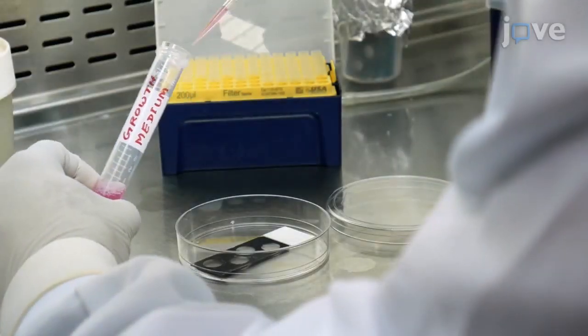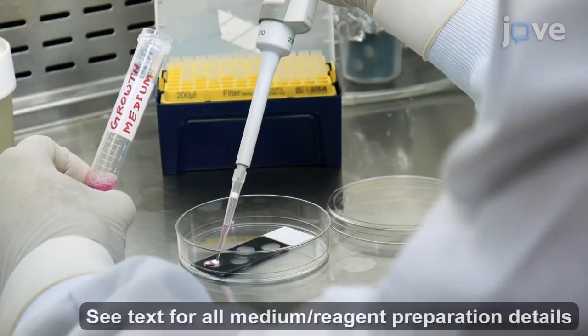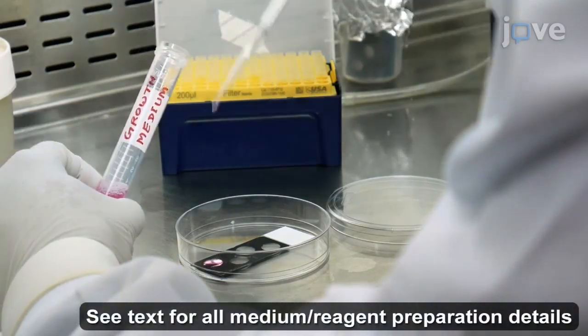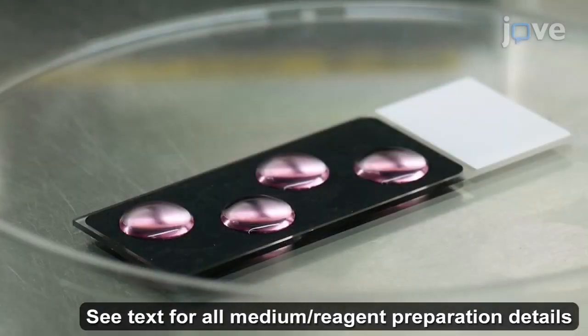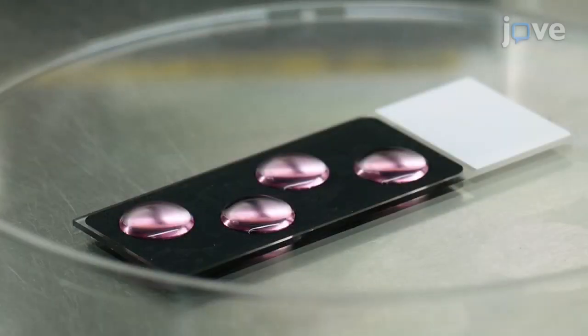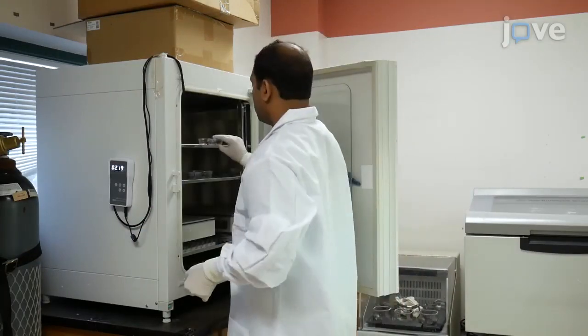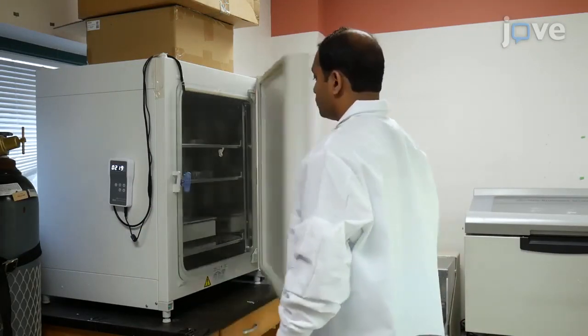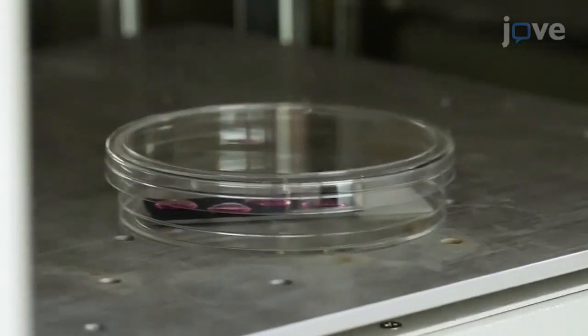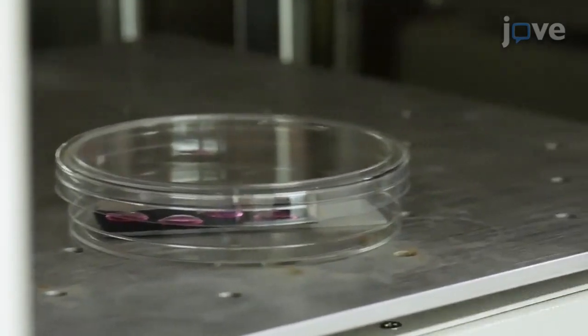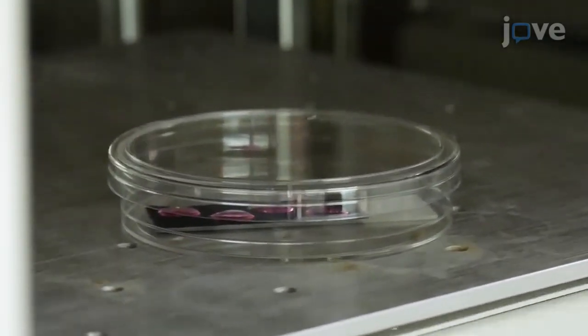20 to 24 hours before the virus infection, seed 5 x 10 to the 4 human embryonic lung or HEL fibroblast cells per well onto a 4-well 11 mm staggered slide in growth medium for overnight incubation at 37 degrees Celsius with 5% carbon dioxide. It is important to rock the slide thoroughly to ensure an even distribution of the cells while taking care to avoid spilling the culture medium.